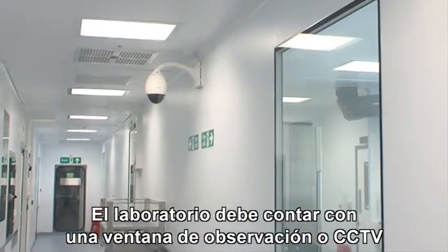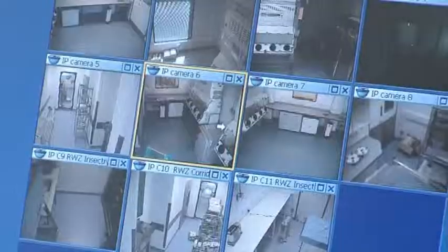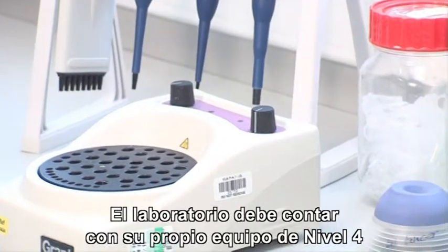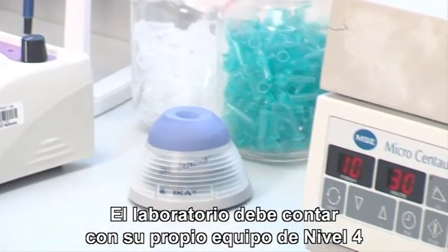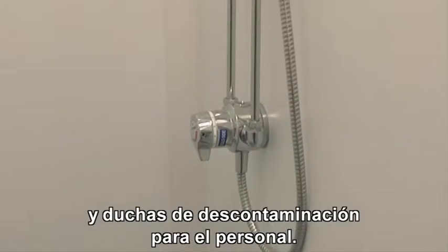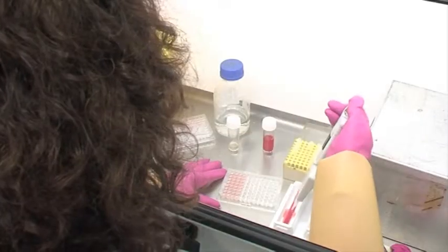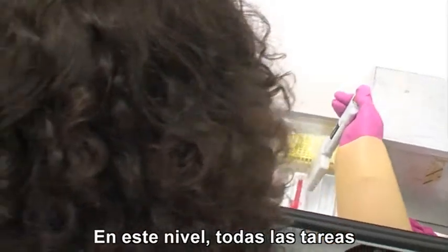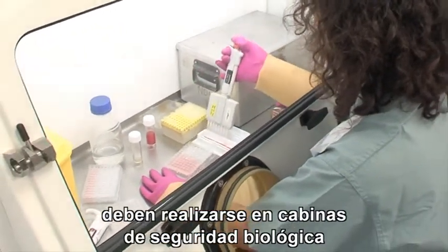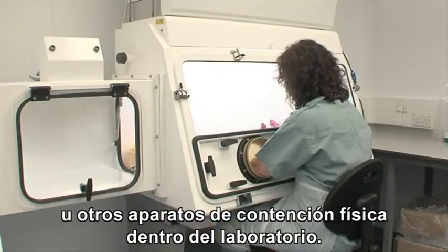The lab must have an observation window or CCTV so that occupants can be seen. The lab should contain its own equipment for level 4 and, as far as is practical, for level 3, and shower decontamination of staff. At this level, all of the procedures that involve the handling of infectious organisms or materials must be conducted in biological safety cabinets or other physical containment devices within the contained laboratory.